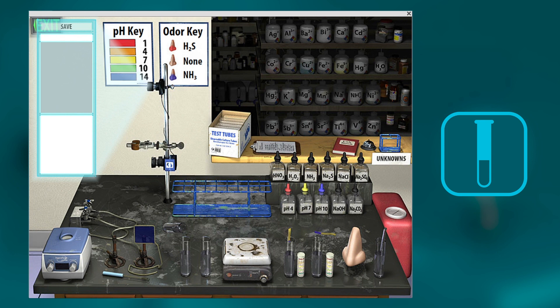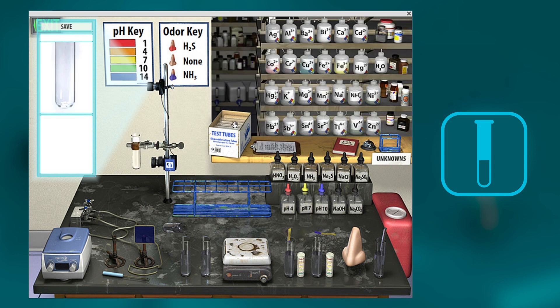So I'm going to show you with a transition metal separation, just so you can see the capability of the labs. We're going to start by adding cobalt, copper-2, and nickel. These are three that are relatively simple to separate, but you need to know the different steps to get there.